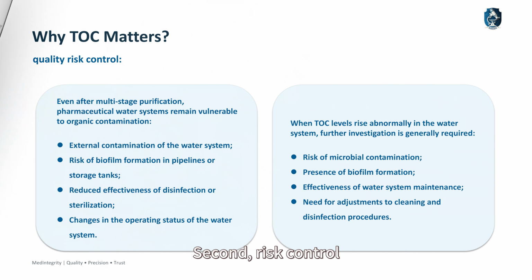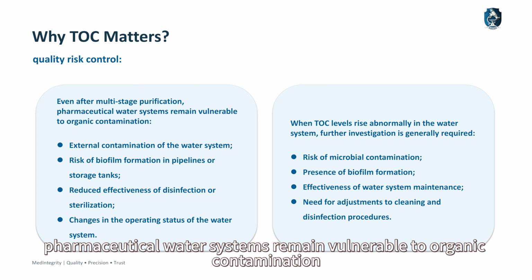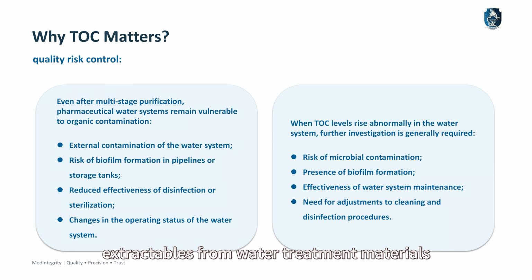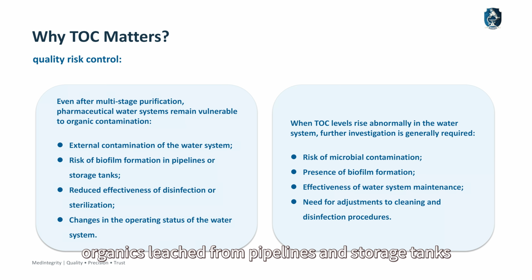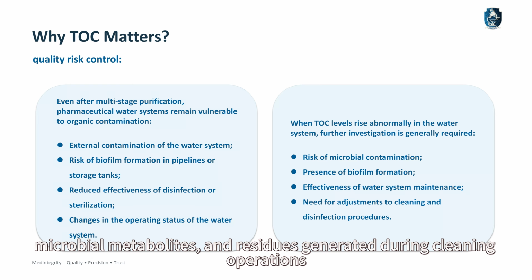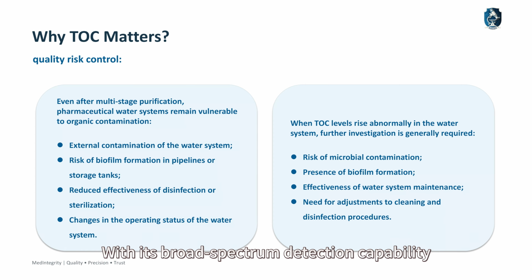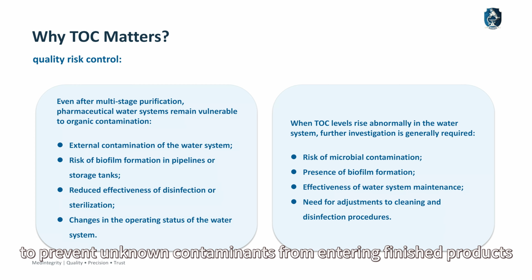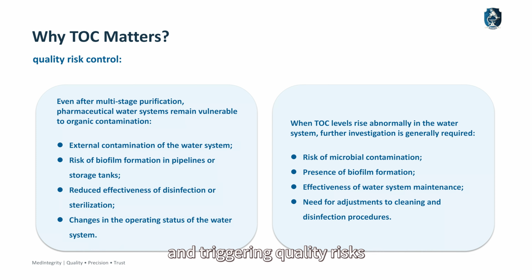system. Second, risk control. Even after multi-stage purification, pharmaceutical water systems remain vulnerable to organic contamination, such as residual organics from source water, extractables from water treatment materials, organics leached from pipelines and storage tanks, microbial metabolites, and residues generated during cleaning operations. With its broad spectrum detection capability, TOC testing enables continuous monitoring of diverse organic impurities within process systems to prevent unknown contaminants from entering finished products and triggering quality risks.